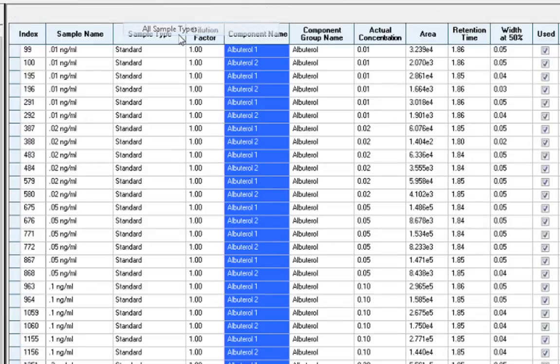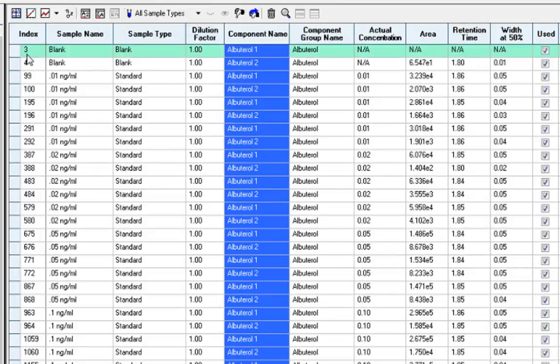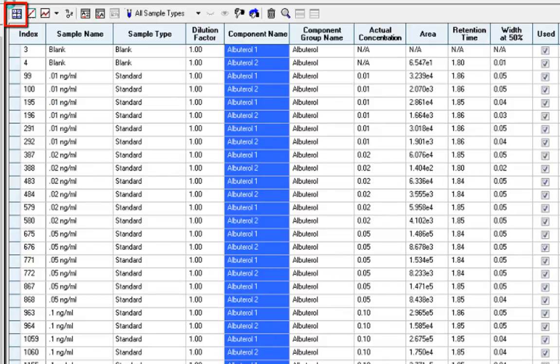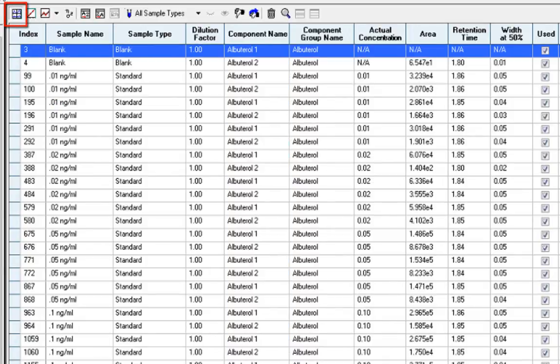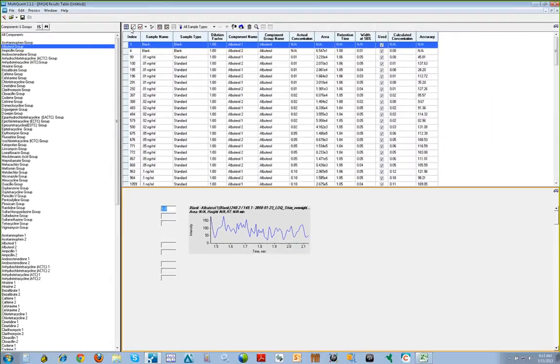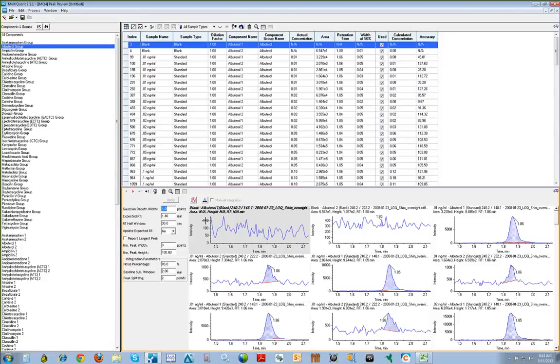If you want to look at the chromatographic peaks of these samples, we click on the top-left icon in the navigation bar, and the chromatogram for a particular sample is highlighted as we click through our table of samples.